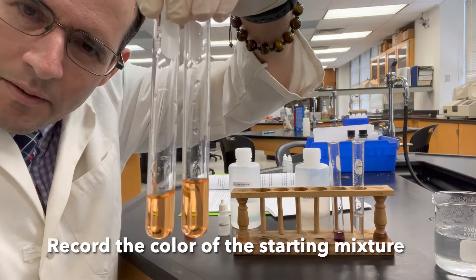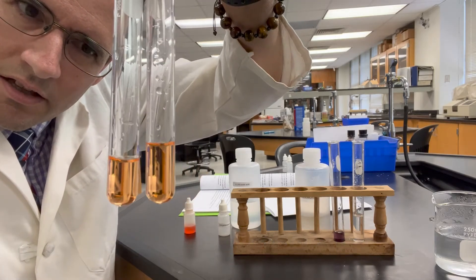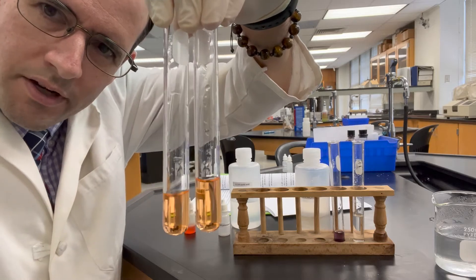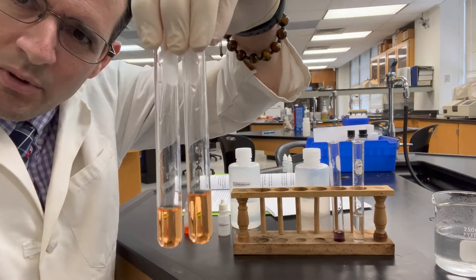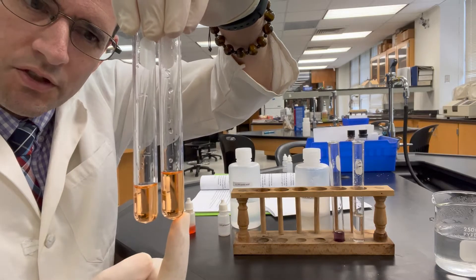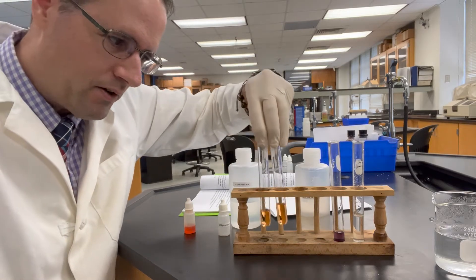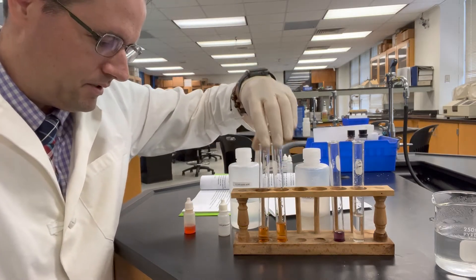In my hand, I have a mixture of sodium acetate and acetic acid. This is the starting color. One of these tubes is not going to be touched — it's going to be our control for reference. We're going to heat and cool one of the tubes and then see: does it change more red or does it change more yellow? By the very end, you should be able to see clearly.